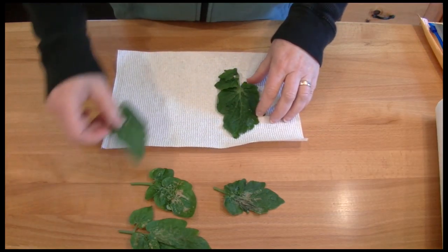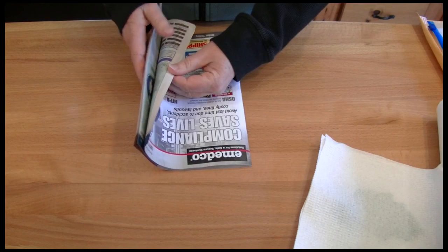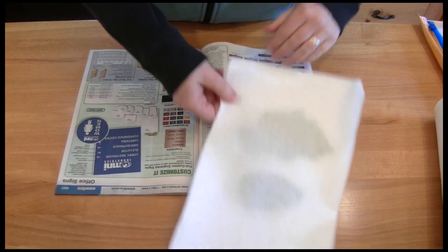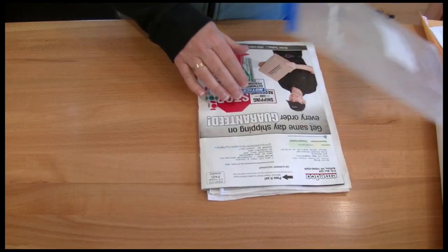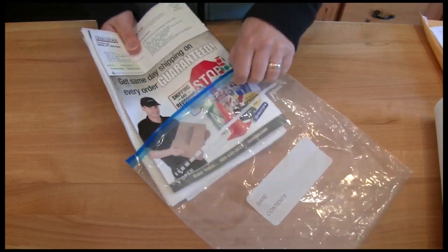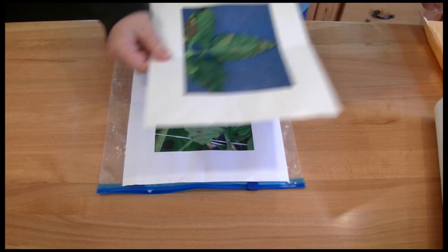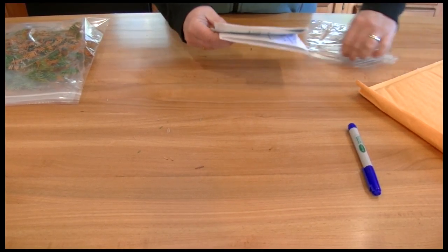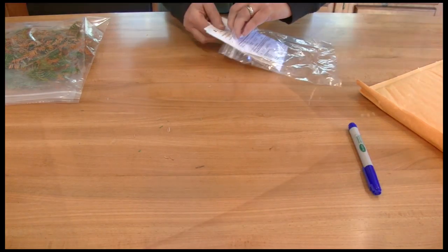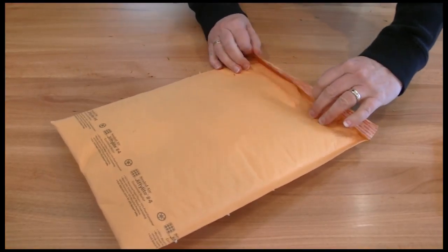Leaf samples should be placed between dry paper towels, then between pages of a magazine, a catalog, or between two pieces of cardboard. Then place the whole sample in a ziplock bag. Be sure not to seal the bag completely, however. Photos, as long as they're in focus, are always helpful for the diagnostic process. Place the completed sample form and payment in another bag.